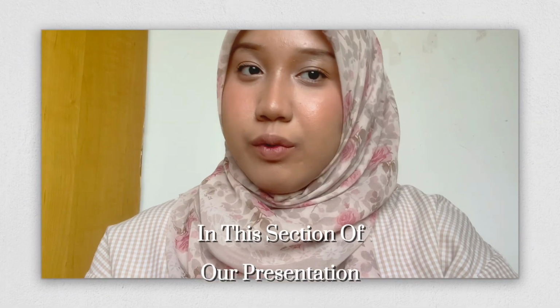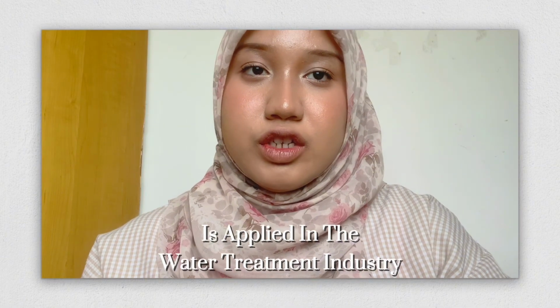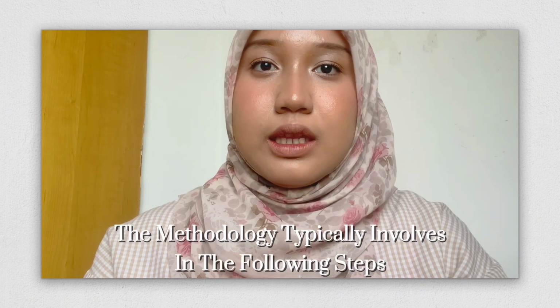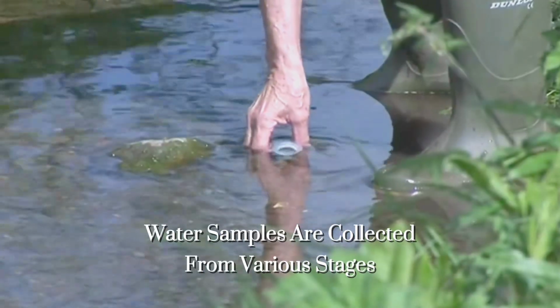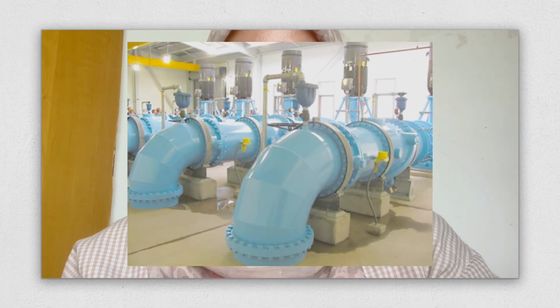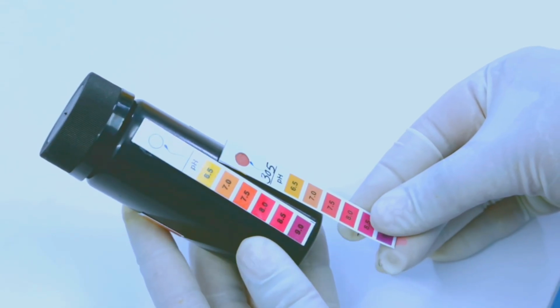In this section of our presentation, I will demonstrate how acid-base titration, a key technique in volumetric analysis, is applied in the water treatment industry to monitor and control water quality. The methodology typically involves the following steps. First, sample collection. Water samples are collected from various stages of the treatment process, such as raw water intake, post-treatment output, or during distribution to analyze parameters like pH and chemical content.